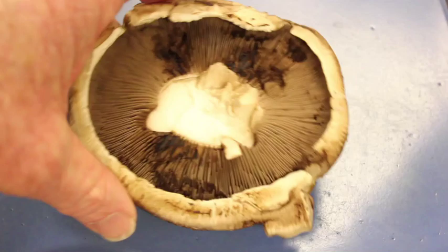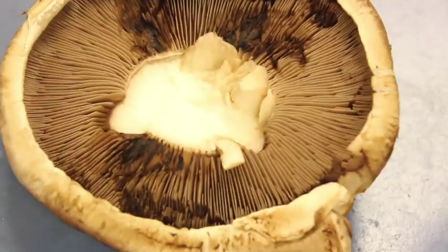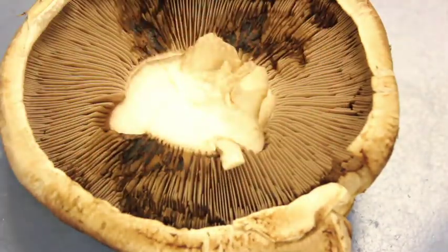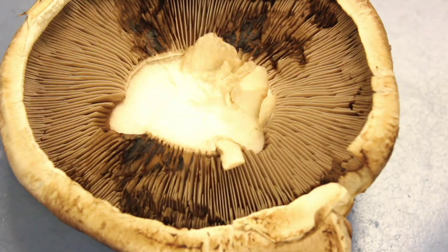We can see inside that it is a gilled fungus. So see all these gills here? The gills give away that it's in the Basidiomycota.